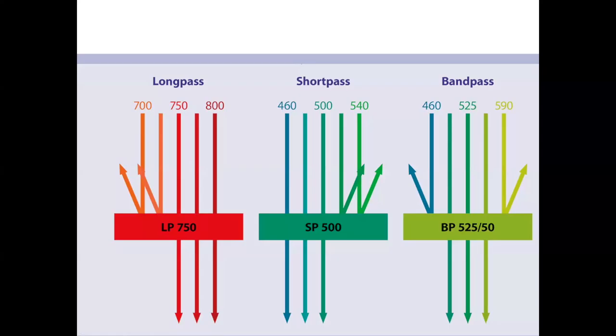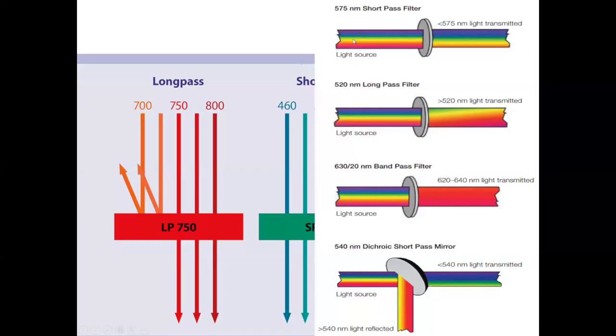Because all the 13 fluorochromes, with the example I'm saying. So let's take a simpler example. So you have a 4-color flow cytometer. All the four fluorochromes will emit signal, right? Now we need to filter fluorochrome A, fluorochrome B, fluorochrome C, and fluorochrome D, and you use dichroic mirrors for that. So see, this is again a beautiful image.